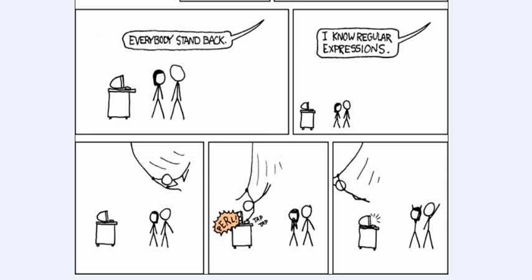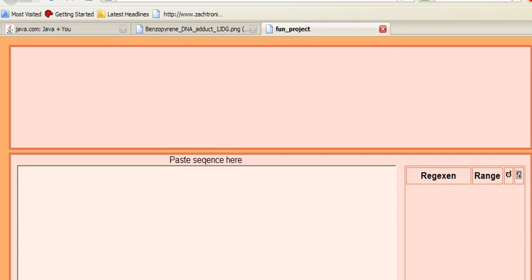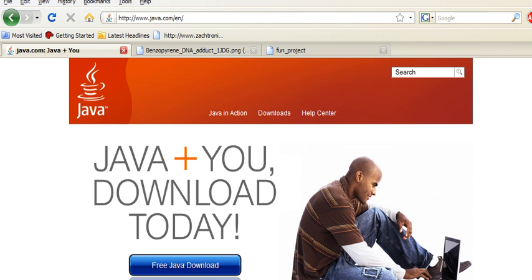Yantra also requires the user to supply the sequences in the standard FASTA format. Yantra is web browser based and runs completely on the client side on many web browsers on top of whatever operating system you're running. However, it requires a Java plugin to be installed. This is generally not a problem, as Java is ubiquitous on the internet, and in the rare case that it's not installed in your system, you can install it directly, easily and for free from www.java.com.